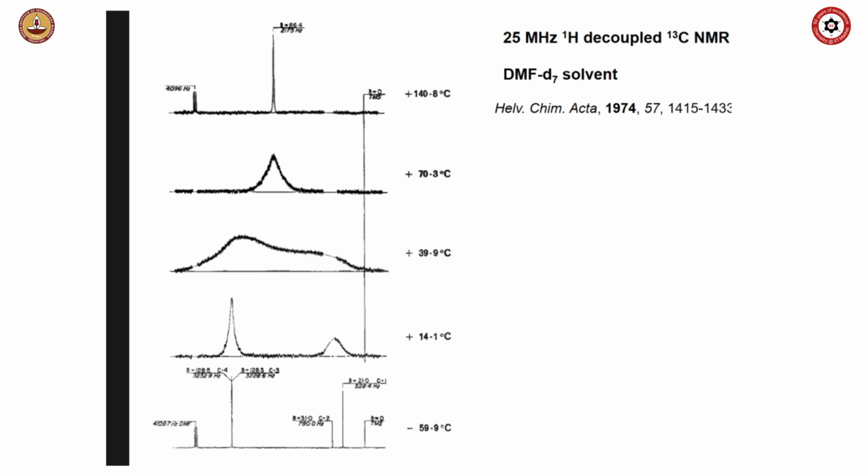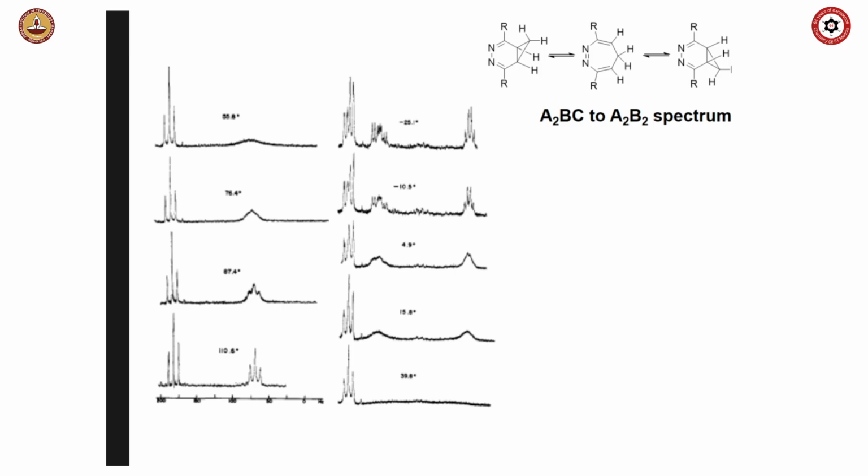There are 2 peaks here. Third and fourth peaks are here. This is another bicyclic system which is undergoing Cope rearrangement. In this particular case, it is a diazine compound. This is what NMR will see under very rapid interconversion. Under slow interconversion, this is what NMR will see.